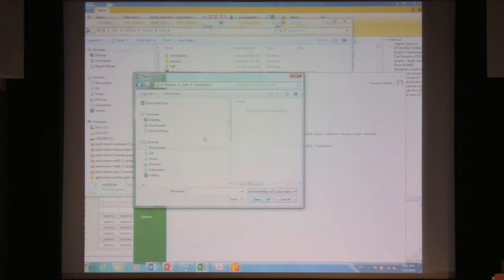Sorry if I missed this. So when you pull in the data from PhosphoSitePlus, is it organism specific? No, those data sets aren't organism specific. So you're just pulling in all data, human, mouse, rat, that's on there.